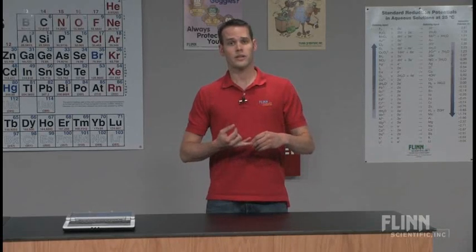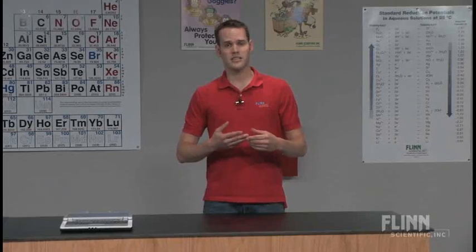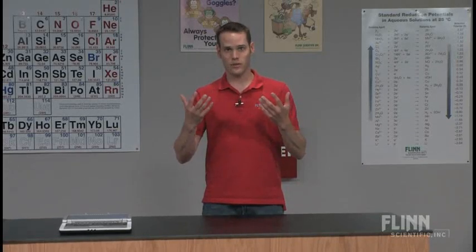But it is a really nice dramatic demonstration that you can use to show very clearly and in a visual way the difference between concentration and its effect on reaction rate, the difference between temperatures and its effect on reaction rate, and also start to introduce mechanisms and the fact that reactions don't always happen in just one step, in a very easy to understand and contemplative way that the students can take with them as a very lasting visual image. I hope that will help your students as much as it's helped mine.